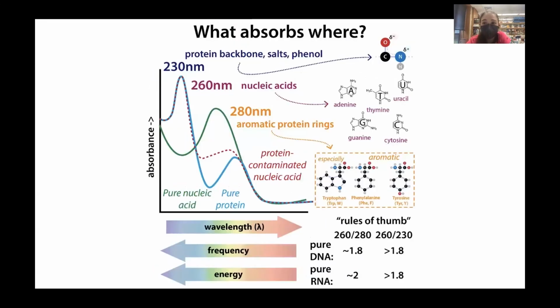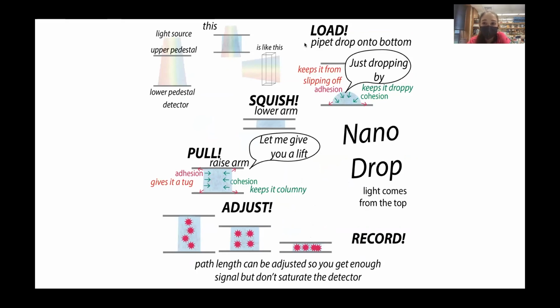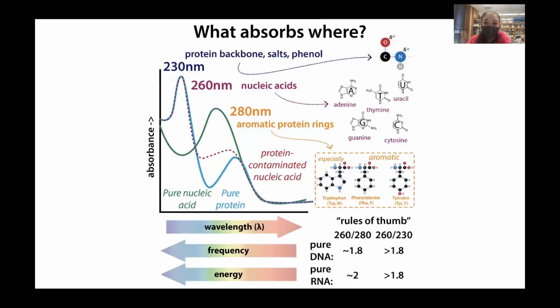At the end of your purification, you're going to want to check and see how pure it was. And so you often do this with spectroscopy, so often like this NanoDrop. Basically the idea is that you shine light through and see how much light gets absorbed. And because different molecules absorb different wavelengths, then you can get an idea about how pure the thing is. And so there's three values that you want to look for: 230, 260, and 280.